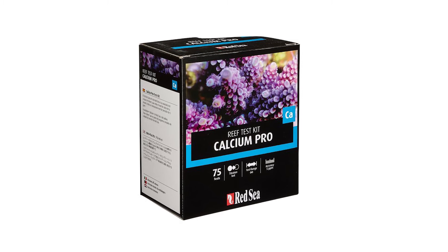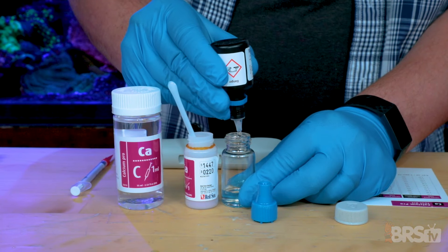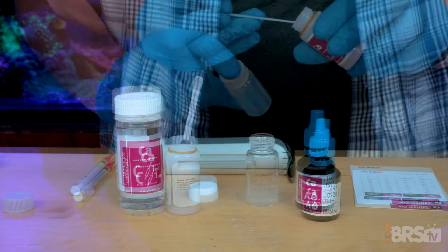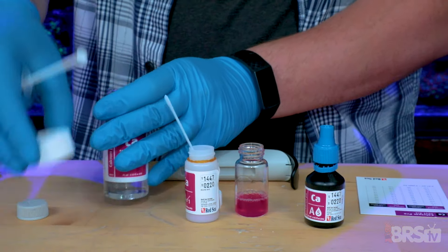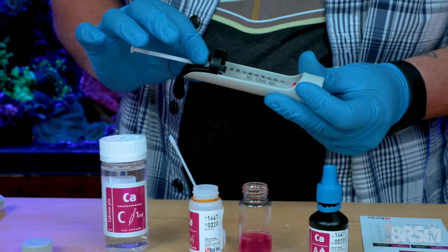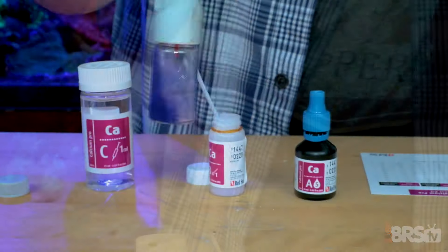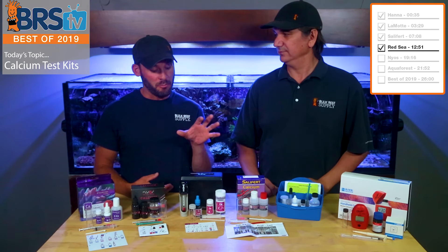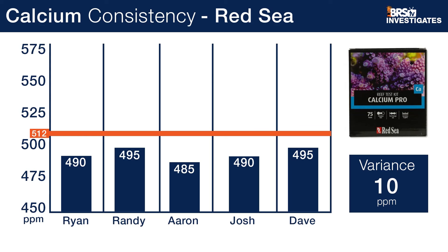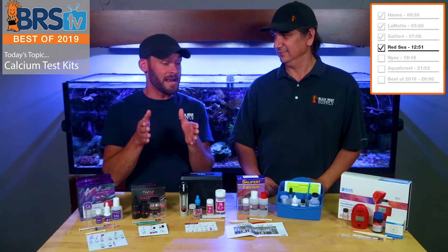Red Sea calcium test kit is next, and there's a whole slew of things we both liked about this one. Starting with the components: it is very clear that every piece of this thing — somebody chose to take a higher-end road all the way from the glass bottles to an actual dropper unit, clear reagent containers, even a plastic box since this thing's used around water. Same thing with the laminated card. Front to end, somebody actually cared about this when they put it together. This one was our best kit for consistency — only a difference of 10 parts per million between the high of 495 and the low of 485 from five people testing it.